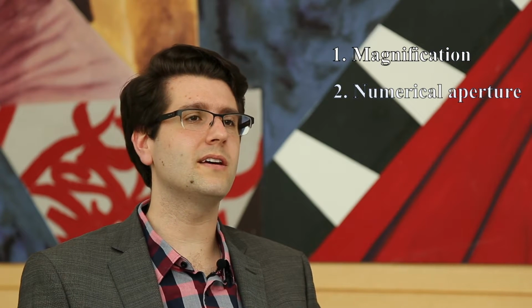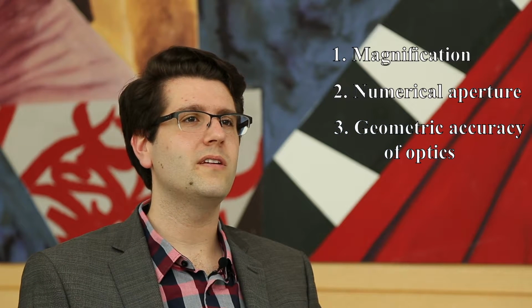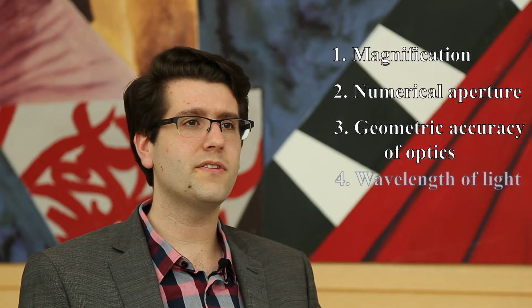As scientists were exploring the phenomenon of fluorescence in the 19th century, England and Germany were in a race for microscope objectives with improved resolution. 4 factors contribute to the resolving power of a microscope: magnification, numerical apertures of the objective and condenser, geometric accuracy of the light rays coming together to form the image, and the wavelength of the illumination light.